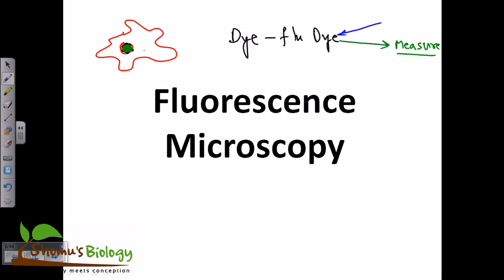Now fluorescence microscopy is mostly used to tag and look at delicate structures inside the cell, like the actin protein, and how actin is arranging, how actin polymerization is taking place, or microtubule dynamics during cell division. So we can see these specific functions going on inside a living cell. That's why fluorescence microscopy is very handy, because we can use it for living cell or living culture imaging. Now let's talk about the principle of fluorescence microscopy and how this whole process works.